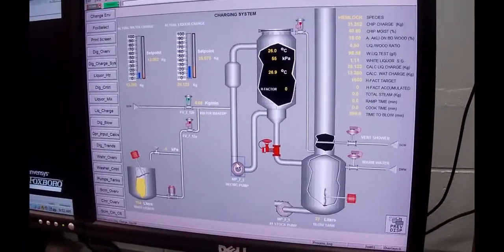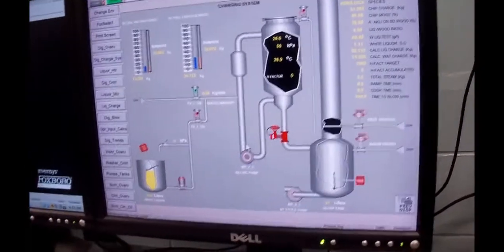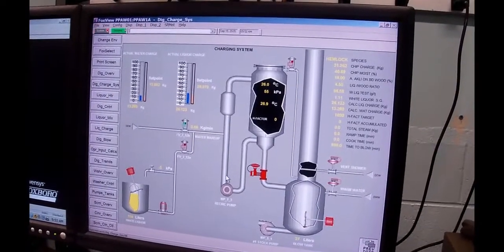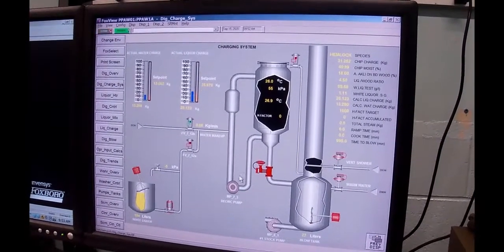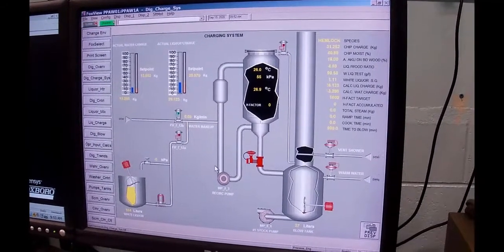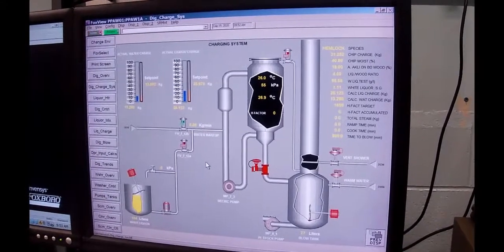And so, back here, make sure that I don't miss anything. So we got all that in. High pressure water needs to be on. I'm looking at the booster pump right now and it's on. I can see a pressure gauge over the other side. And you saw us turn it on at the very beginning.